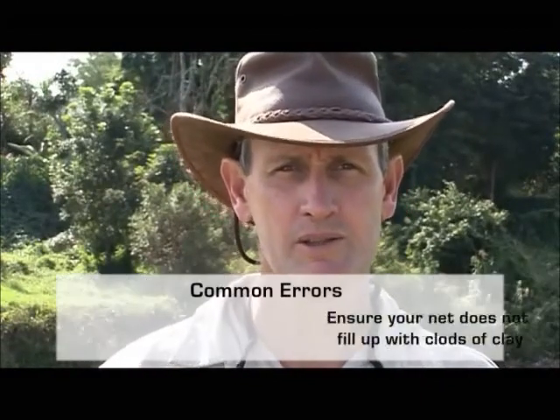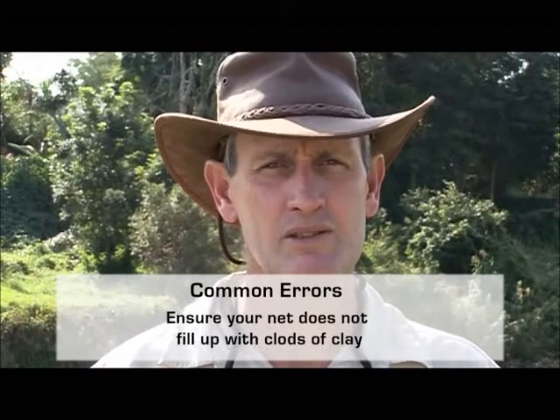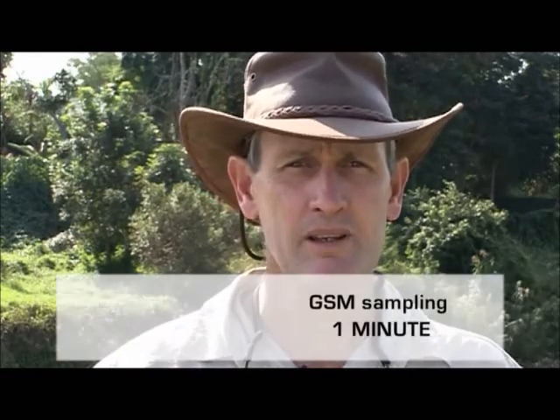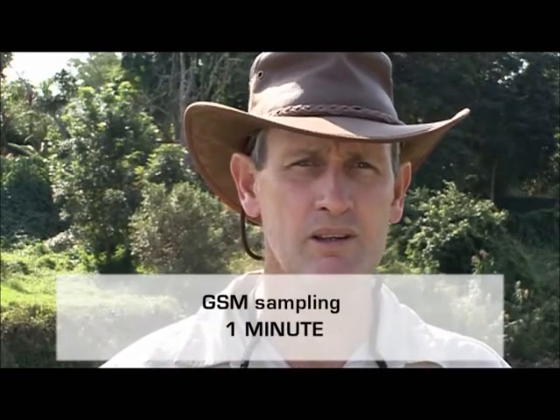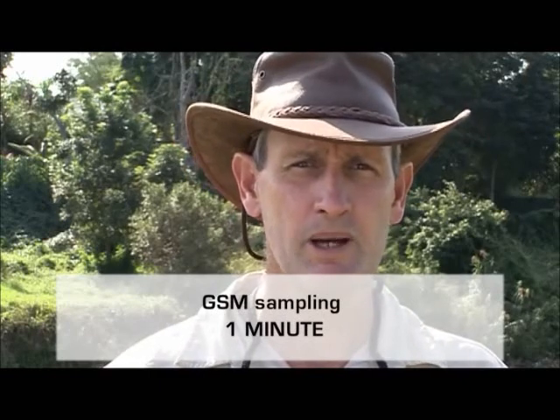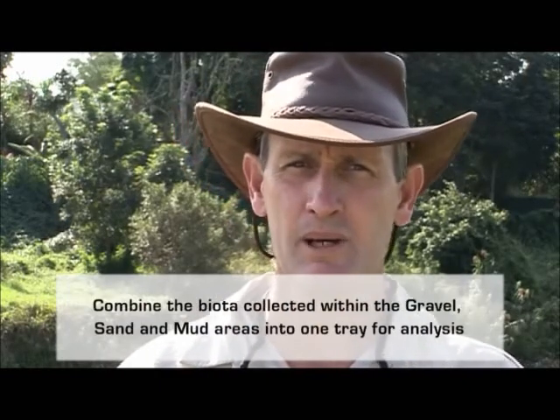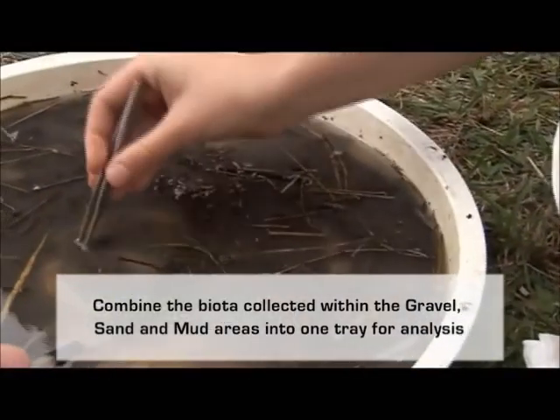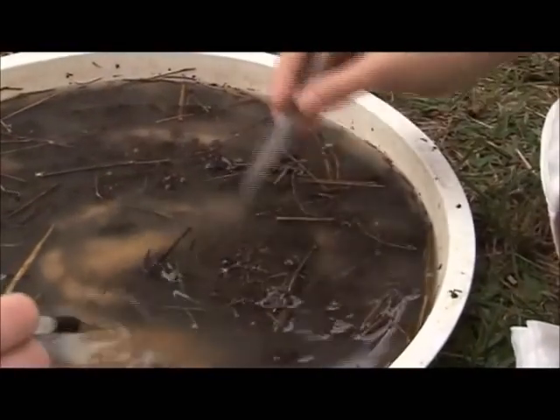The other thing important is to make sure you don't get big clods of clay sitting in your net, so wash through your net carefully at the end of your sampling, to wash out those fine clay fractions which otherwise cloud the water. The overall sampling is strictly 1 minute in total, and all of those 3 sub-biotopes, the gravel, the sand and the mud, get combined into a single biotope, which is what we would be looking at, analysing and identifying later.